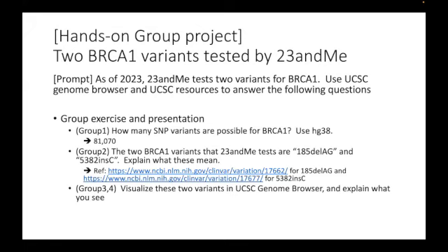So let's see. And the Illumina CEO said the machine is NovaSeq X Plus or NovaSeq X. The machine price is about 1 to 1.2 million. The base machine is already delivered. What's not delivered is the flow cell, the flow cell that goes into the machine. They delivered the low density flow cell base model, but they promised a high density flow cell. When they deliver the high density flow cell, the price will go to that point. So that's what you are actually, if I have to know, I would definitely tell you.